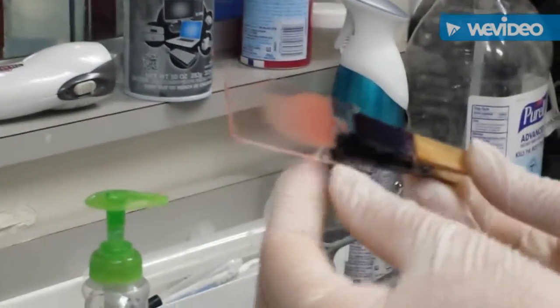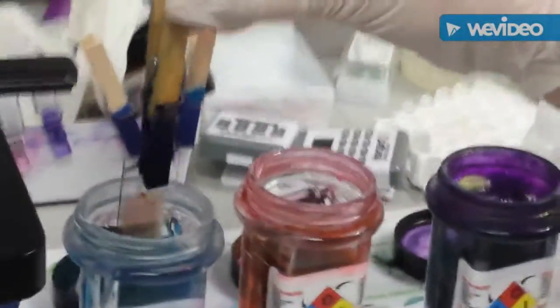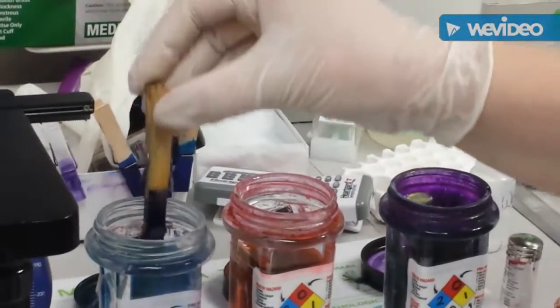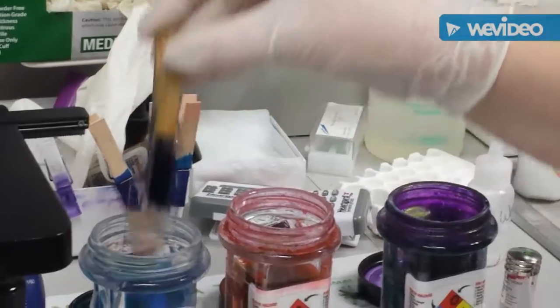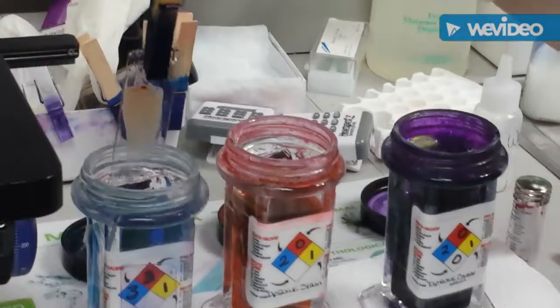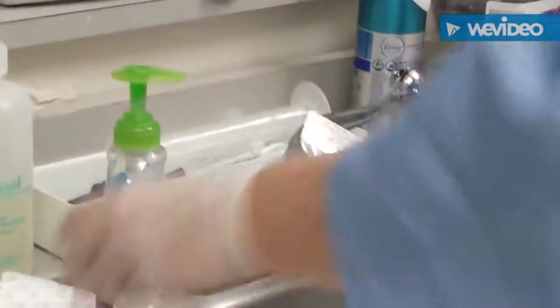And then we're going to go ahead and stain our second slide. Again, 10 1-second dips in each one. Your ideal slide would be completely straight with no waves in it.